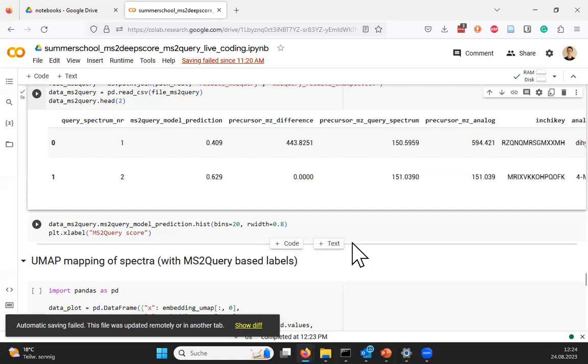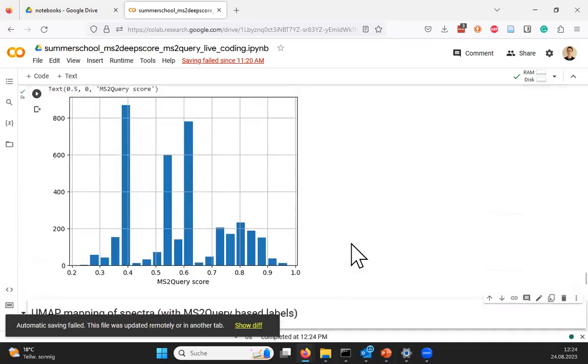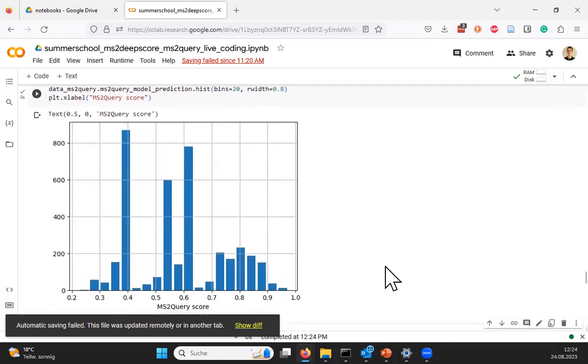So we can plot them. And how do you plot them? That's exactly where these things that we did so far come together. A simple plot is fine. So I can do some histograms. What I'm doing here is I take all the model predictions and I do a histogram. So this is a distribution, and this just shows you how, among all these 3,800 compounds, what the findings were. And then we see that we find some distributions, and generally that's up to you.